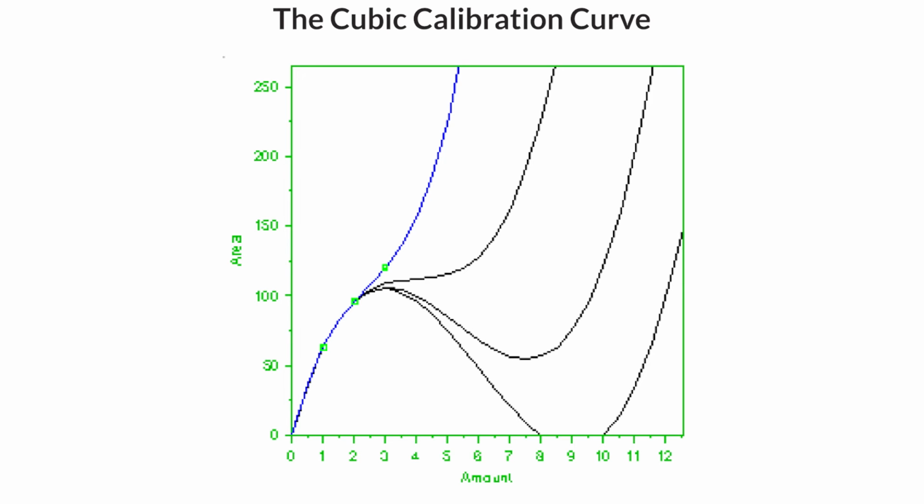Like the variations in weighting discussed above, slight variations in one of the data points may significantly affect the behavior of polynomials outside the range of the data points. If the curve is not forced through the origin, then the origin lies outside the range of the data points, and the intercept may be similarly affected, causing inaccurate quantification at low levels.